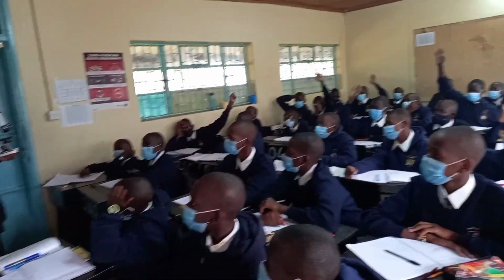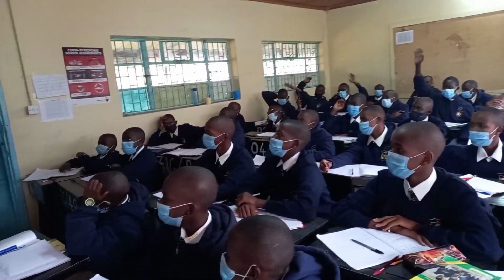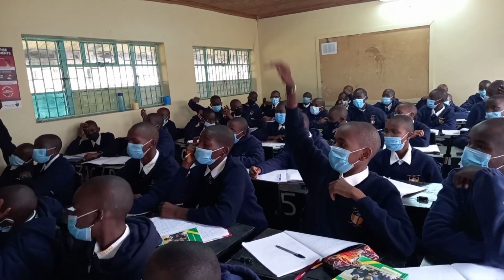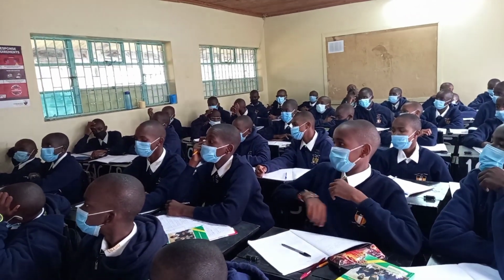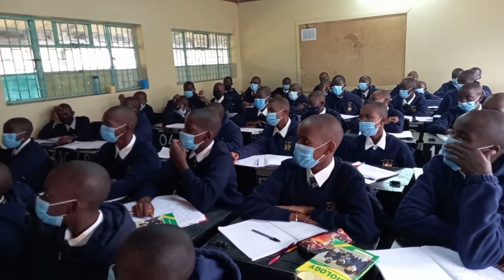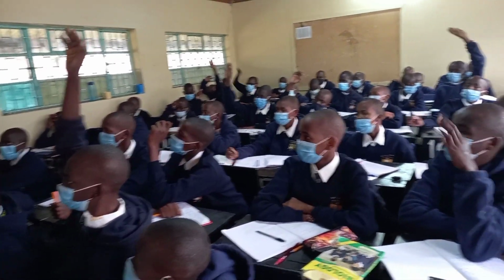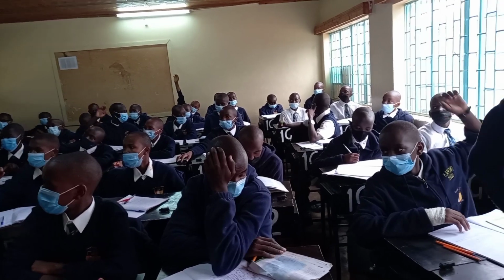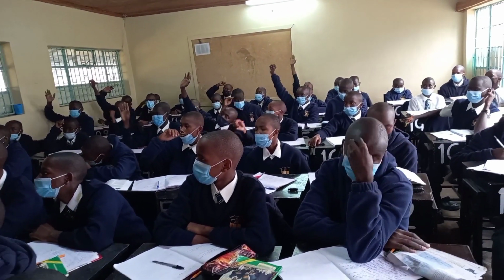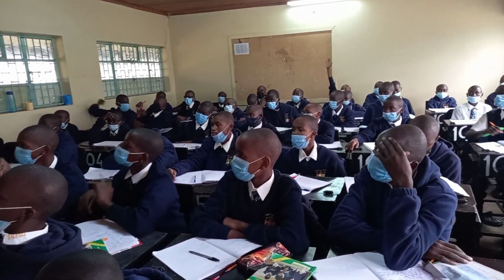Without the mirror, we cannot have what? Light. So what does the mirror do? It reflects light through the condenser, onto the stage to illuminate the specimen. The function of the base? Provides firm and stable support. What is that for? It provides support to the stage and the body tube.